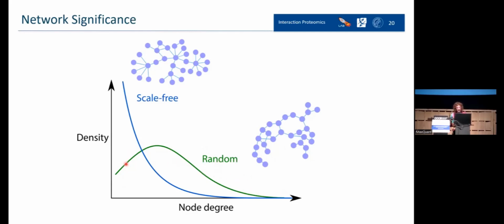So if you calculate all the degrees in your network and you see that they have a normal distribution, probably there have been some errors in that network, and probably your network is not so reliable in that case. I mean, maybe everything was done right. It's just a problem that maybe there were some errors during the experiment. It means that probably it does not have a very important scientific, biological value.